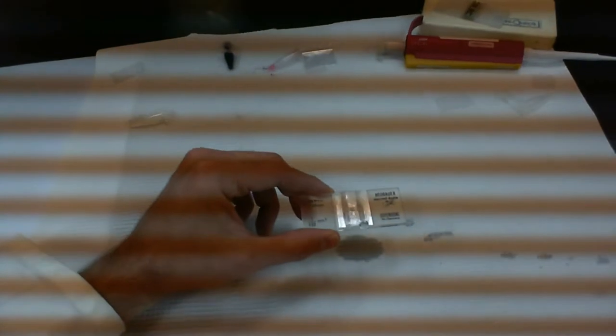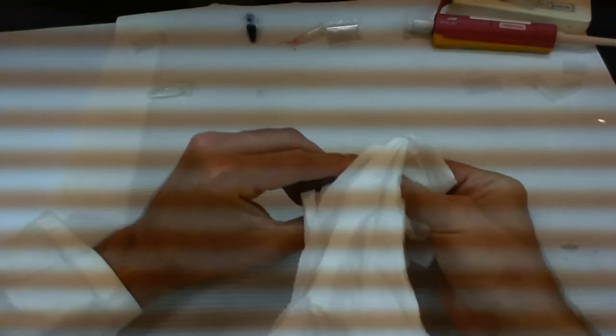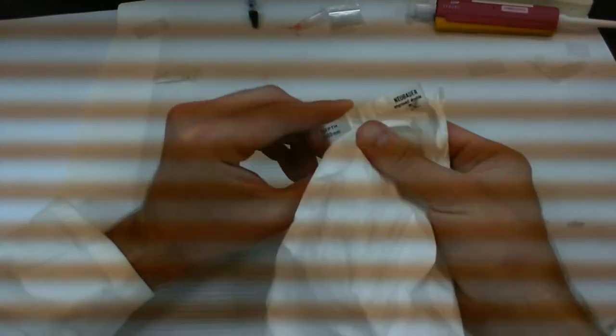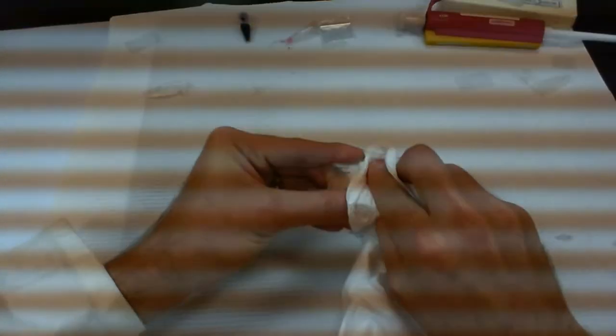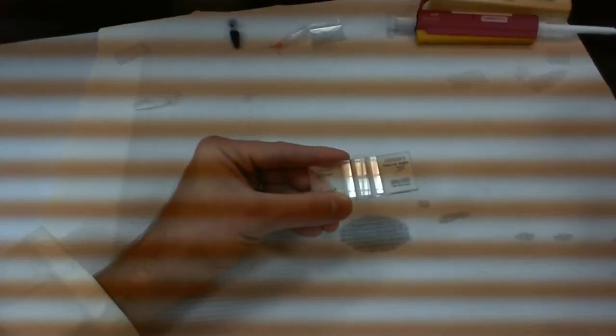and wipe it down. Now, ideally, you want to use a Kim wipe to wipe these. If you don't have a Kim wipe, you can use a paper towel. Just be aware that paper towels will leave fibers behind, so you need to wipe your slides very, very well to try to remove as much of the dust and fibers that might be left over. So what we have now should be a fairly clean slide.